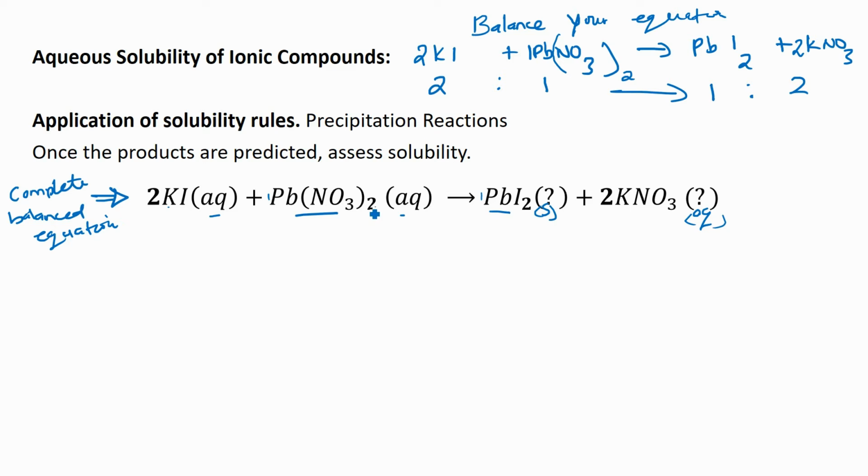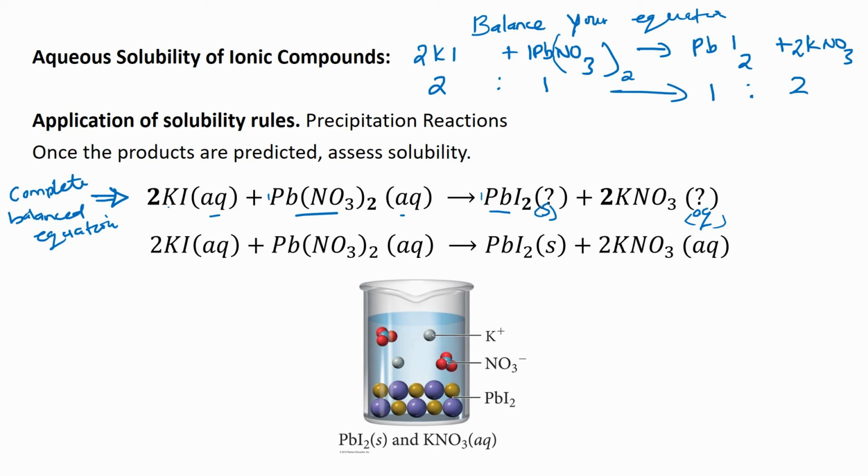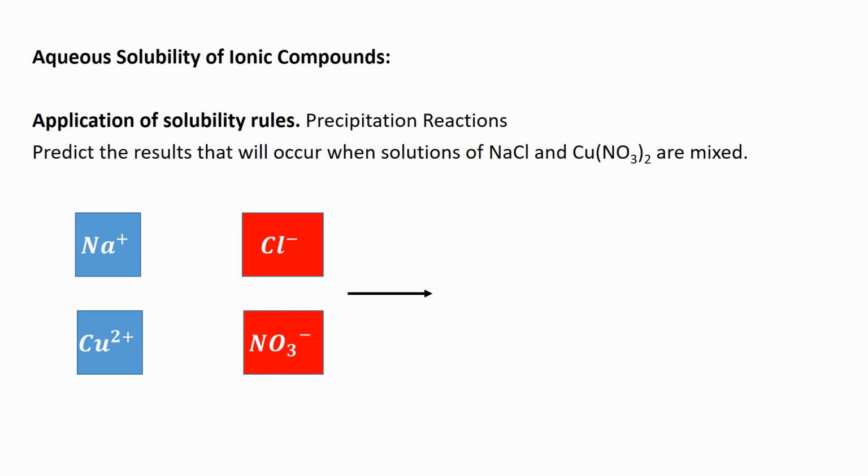They did not take part in the reaction. So that's why we'll have to generate the ionic equation. Alright, so precipitates are solids formed during the reaction, and that's why you see there's going to be solids just down the flask.